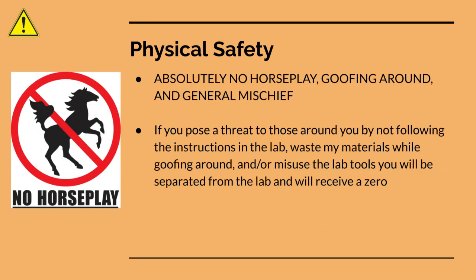Okay, so this is my big rule. Absolutely no horseplay or goofing around, general mischief. None. I do not tolerate horseplay in my lab. Now, jokes are one thing. If you want to tell a knock-knock joke to your friend, that's fine, so long as your friend obviously acts appropriately, and as long as that knock-knock joke isn't doing anything that could potentially cause physical harm. But I do not tolerate horseplay.